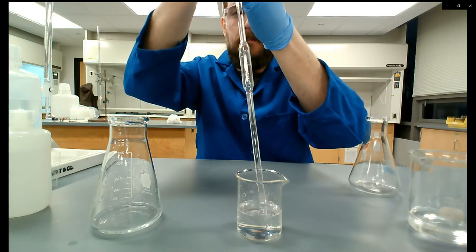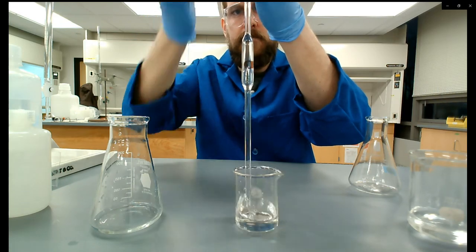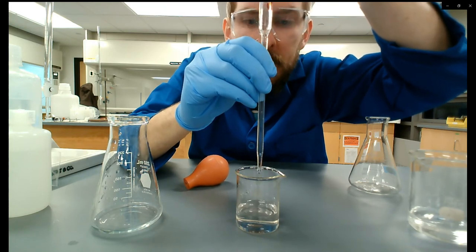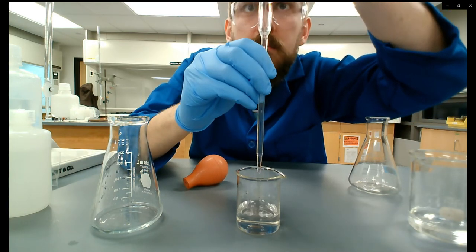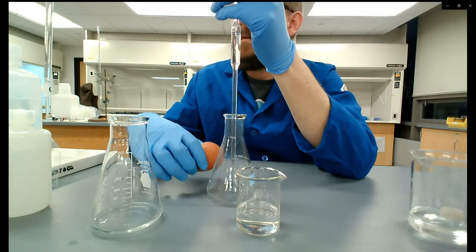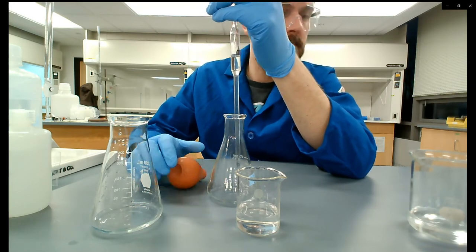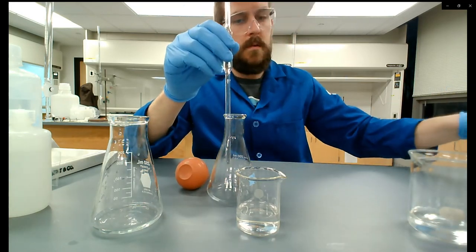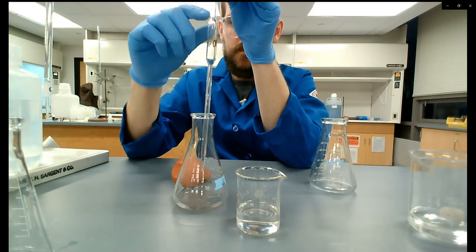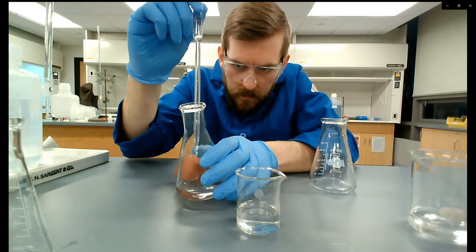Start again — pull the meniscus up past the line, pull it out of the vinegar, let it drain until the bottom of the meniscus reaches the top of that line, tap it off, and drain into the Erlenmeyer flask. While it drains I tap the bulb on the table and grab the next Erlenmeyer flask. Notice there's a drop left so I'm tapping that in.